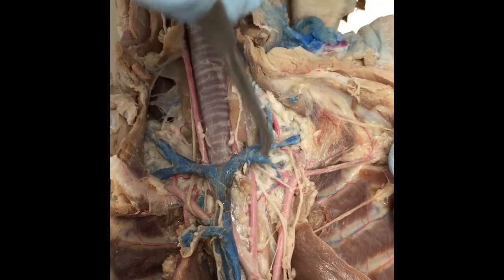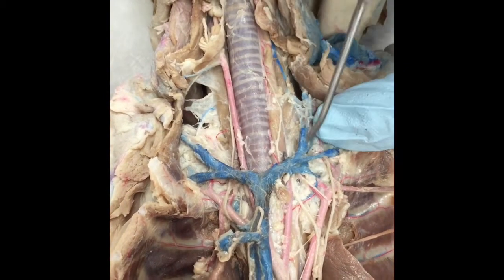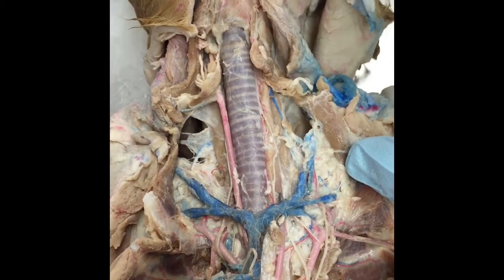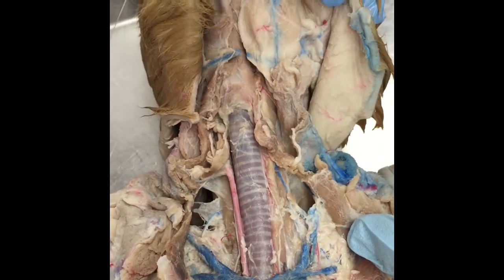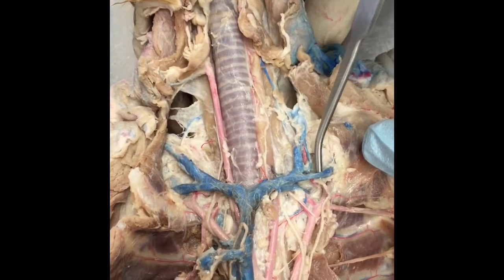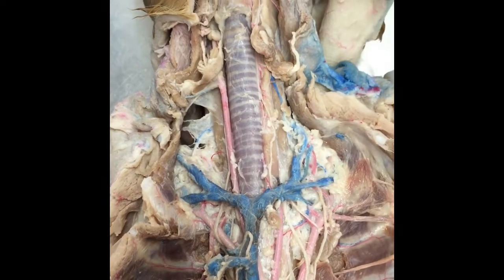costocervical, this one. The first branch goes deep and posterior, and then you have this major branch, which is the external jugular. It goes all the way here and then up, and then you have the transverse jugular, which is cut here, and the posterior facial and anterior facial, right? And this one will be the left subclavian, and you have other small branches which we do not cover here. And that's it.